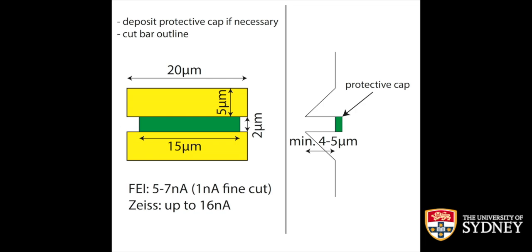The first cuts mean that we cut the basic shape of the bar. In this case, we want to do 5 lift out pieces, and maybe also produce a small TEM sample as a reference from the remaining bar.